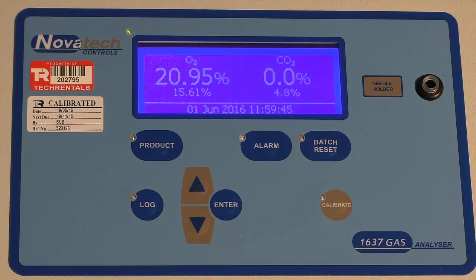A quick test to see whether or not the system is working is to take the sample line, remove the needle, and just blow into it for a few seconds. We can see the result: 16.1% oxygen and 4.3% CO2.